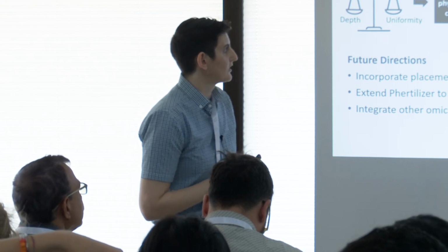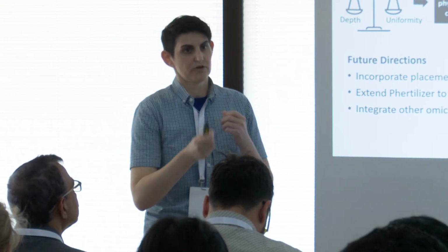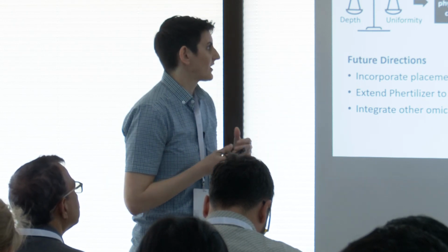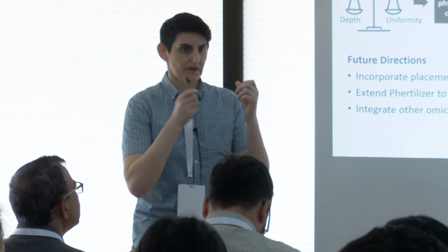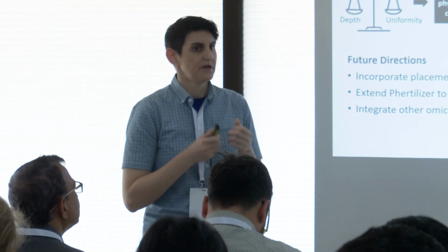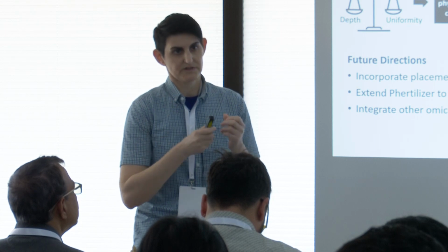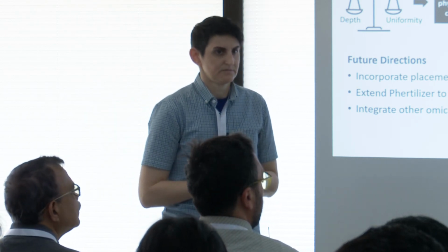Currently we're enumerating them. We're trying all possible combinations of linear and branching on each one, and then growing our candidate set. As I said, this data is very sparse, so the trees aren't going to get that large, which makes it still tractable. But we've been thinking about whether there's a way to prune this process so you don't have to look at trees that are not promising.